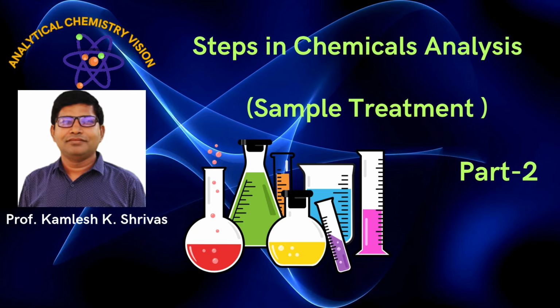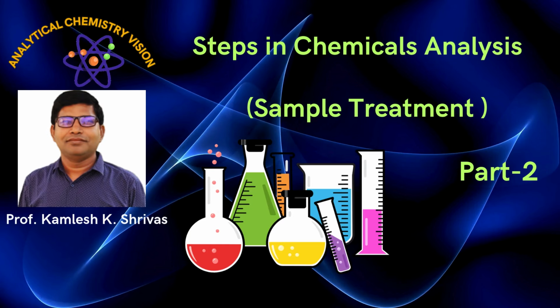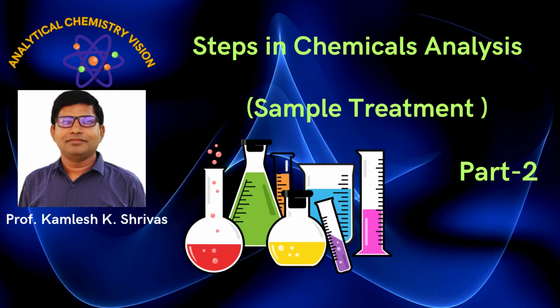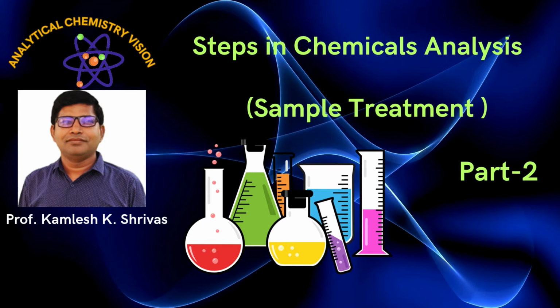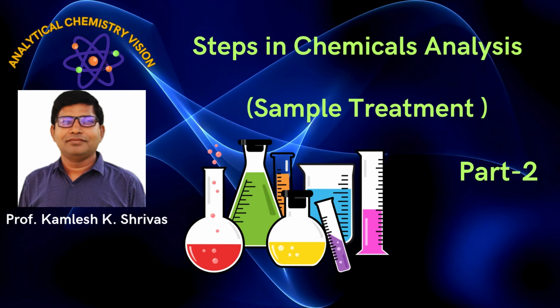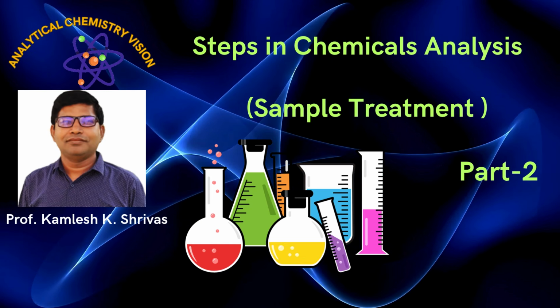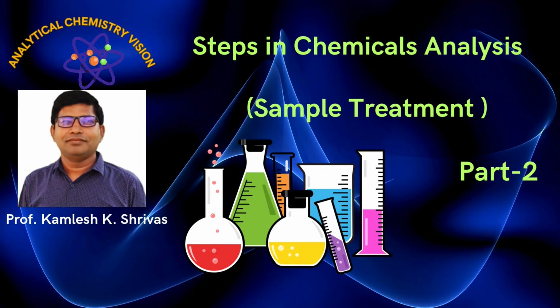Let us begin a very interesting and highly useful topic for UG, PG, and research students, the second part of chemical analysis, that is sample treatment. In this lecture, we will learn that after sampling of soil, air, water, food, and clinical samples, the next step is pretreatment into a measurable form of substance using classical and instrumental methods for their chemical composition determination.